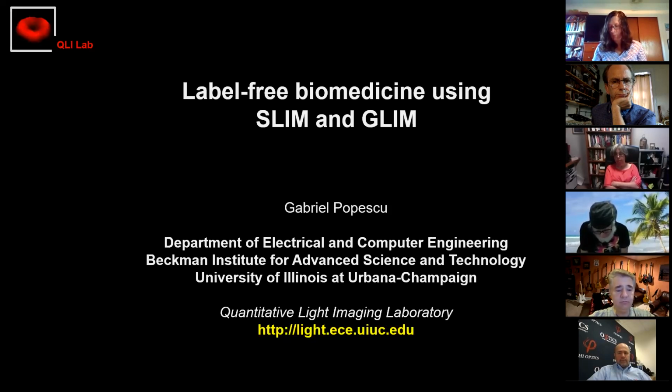In terms of metallurgical applications, let's say, if that's a word, I think the method that works now in reflection could go out of the box. Of course, you wouldn't have made it with a transmission method, but in reflection, I think we can look at all kinds of applications. I can imagine quantifying roughnesses, things like that. Topography can be done to very, very high accuracy.